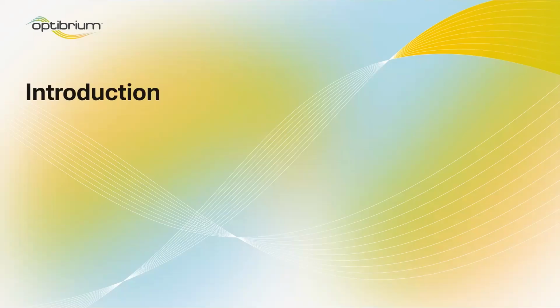Collaboration. You've told us time and again that you want StarDrop to ensure that you are looking at exactly the same compounds and data as your colleagues. When there are new assay results or new ideas, the whole team needs to know. So why is that such a big thing for us?